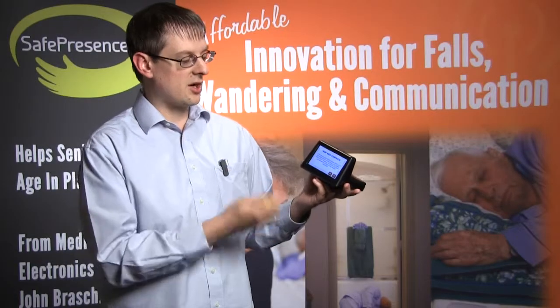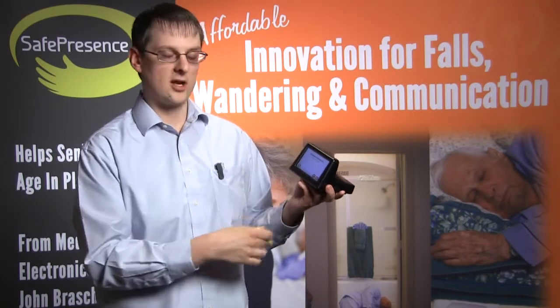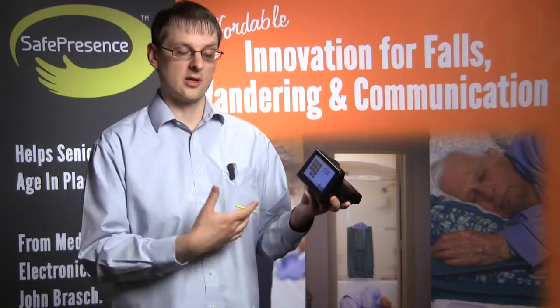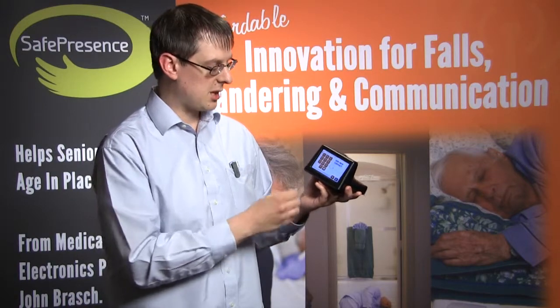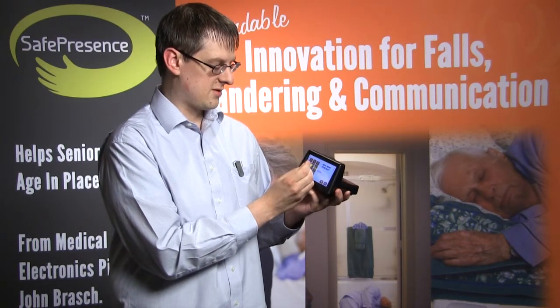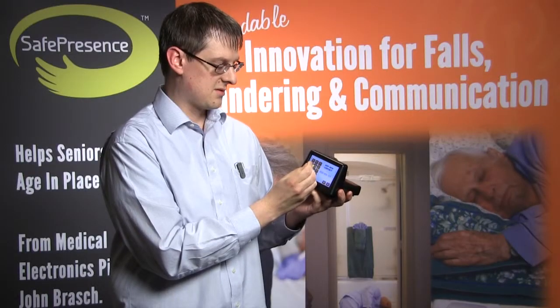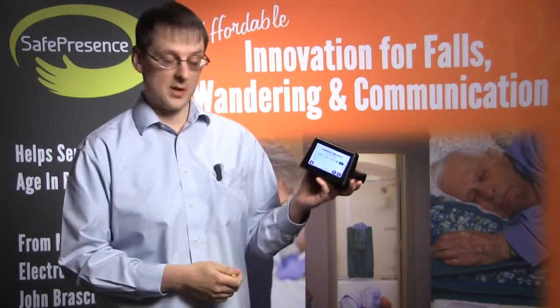The next page is our add new contacts. Tells you a little bit about what we're going to be doing here, but basically you're adding a wireless phone number that we can send text messages to about the alerts that are happening. We have our add new contact screen automatically comes up. Let's put in the movie favorite. 555, 555, and we can confirm it.